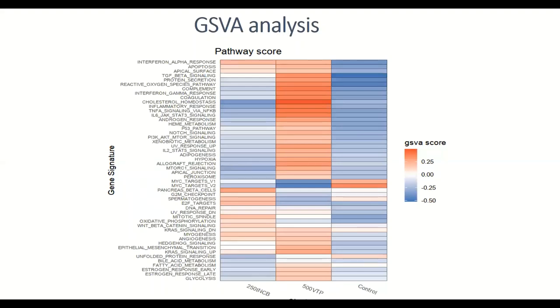And this just shows again the gene set enrichment analysis. Because for single cell, there's a disadvantage. Basically, right now the technology is only able to generate data for about 2,000 genes. But for human or mouse overall, we have about 20,000 genes. So lots of genes were not sequenced, and there's no information for about 80% of genes. So this is why the traditional GSEA analysis does not work.